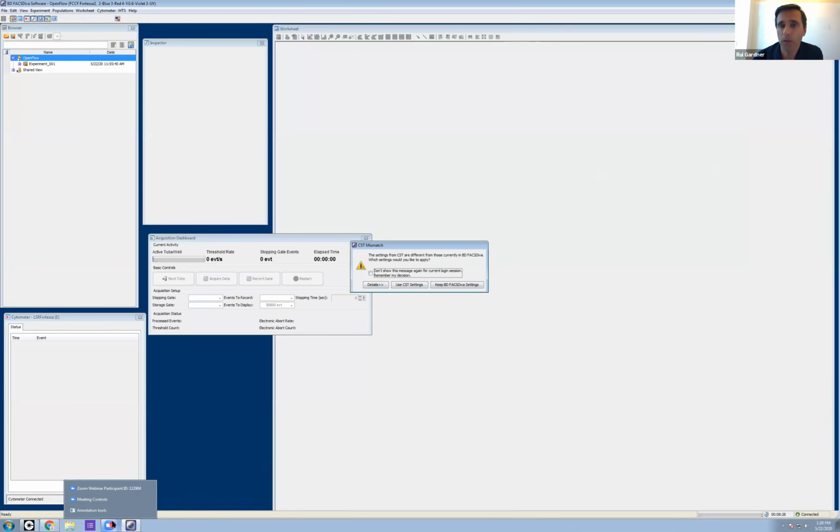Okay, so when it comes to QR values, the baseline, are there any typical values that should be expected from the cytometer? Sorry, I might open up that Q&A myself. Okay, so Kathy, the question is about the QR values that we get in the report. Is there a typical value for those?